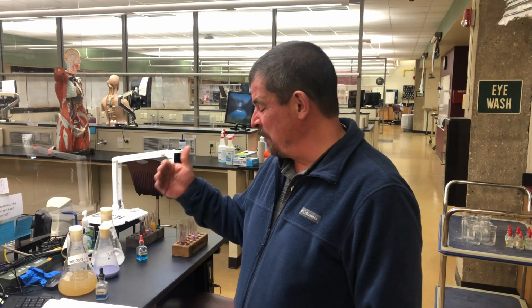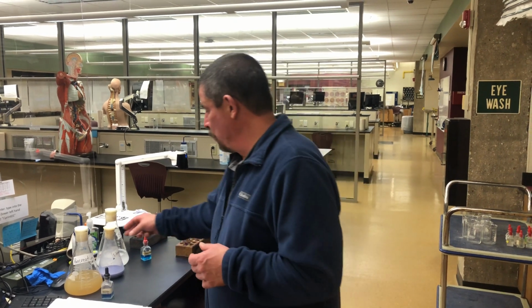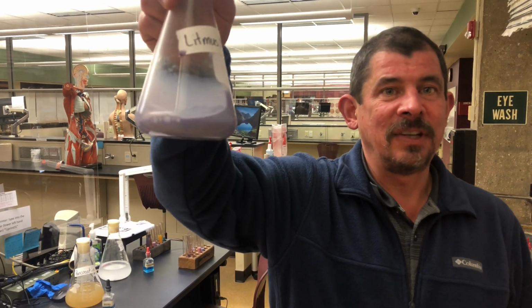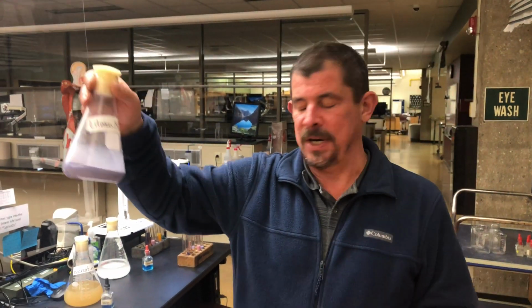Okay. So what we're going to show you now is the fat digestion experiment. And so again, we're still on page 46 of your lab checklist. And if we go down the list, what we're going to do is add a mixture that we have already made up at lab. And if we read it, it contains both milk and a litmus solution. So when we look at this, here is that solution right here. Almost looks like a blueberry milk. This is the solution that we're going to use for the fat digestion demonstration.